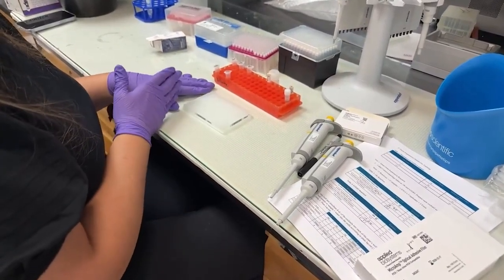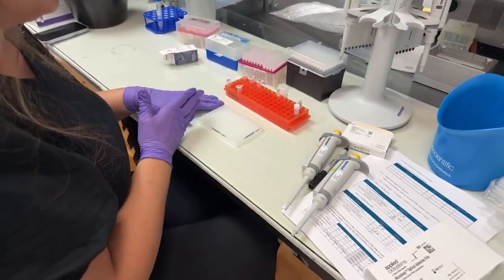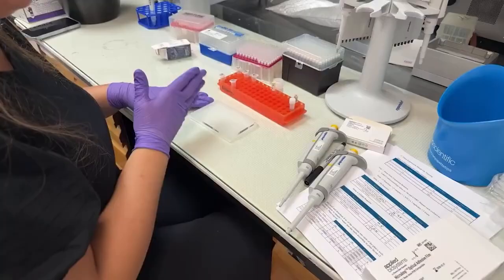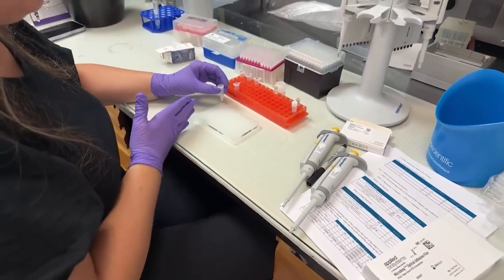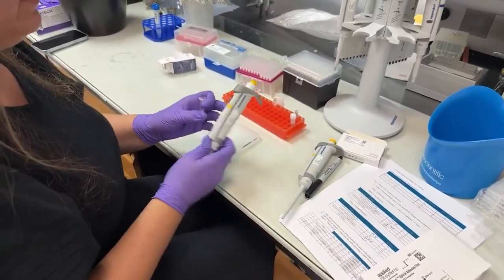So I'm going to put 3: A1, A2, A3, and then C1, C2, C3, and every other one going down. So I'm going to have a column of my 18S in triplicate.